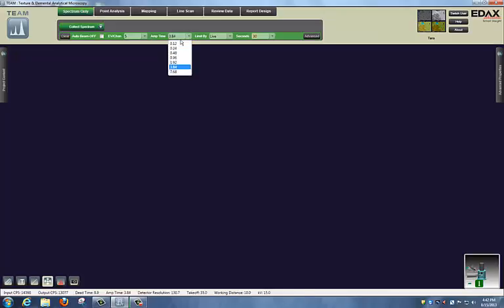The amp time indicates the processing time of the detector electronics. All EDAX detectors will give you a choice of processing times. The higher the value is, the longer the processing time, and that's generally where you'll find the best resolution for your detector performance. As you speed up in the processing time, you'll notice that your dead time decreases and your efficiency or your output count rates will increase for any given input count rate.